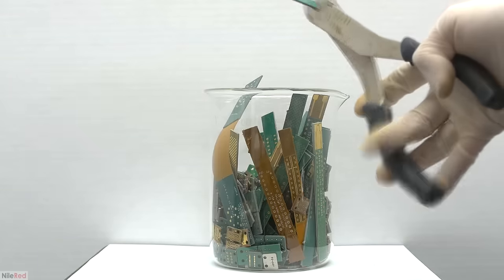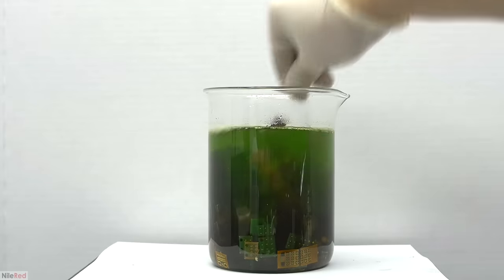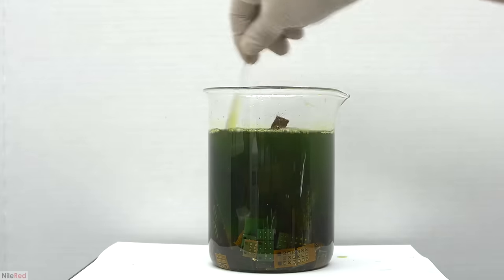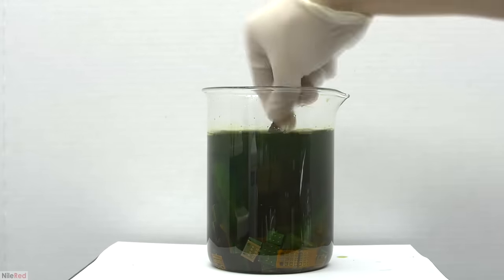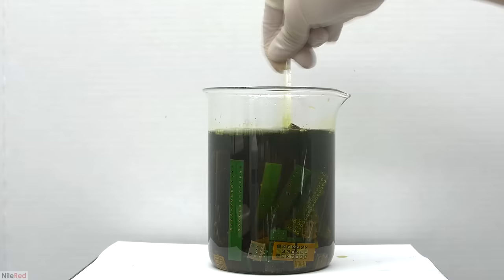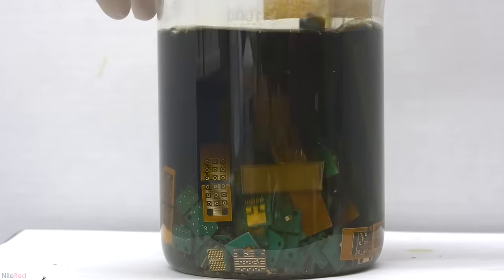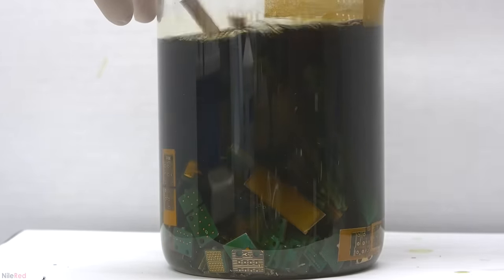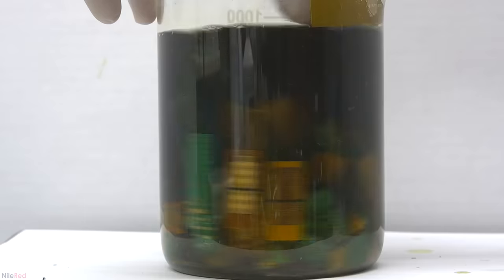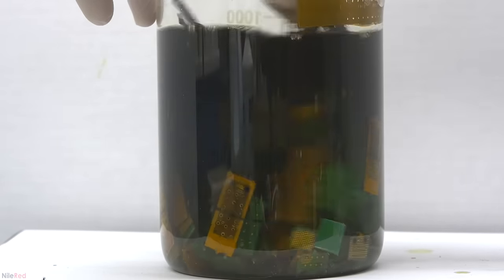Today we're going to be processing a little bit of gold from scrap computer parts. A lot of computer parts are plated with a small amount of gold, and with a little bit of chemical treatment we can isolate it. The profitability of this endeavor depends entirely on how cheap we can get the chemicals and the computer scrap. The prices of the chemicals are pretty consistent, but the cost of the scrap can vary greatly. Ideally, you want to pay the least for the most gold content, but getting good deals takes a surprising amount of knowledge and research.